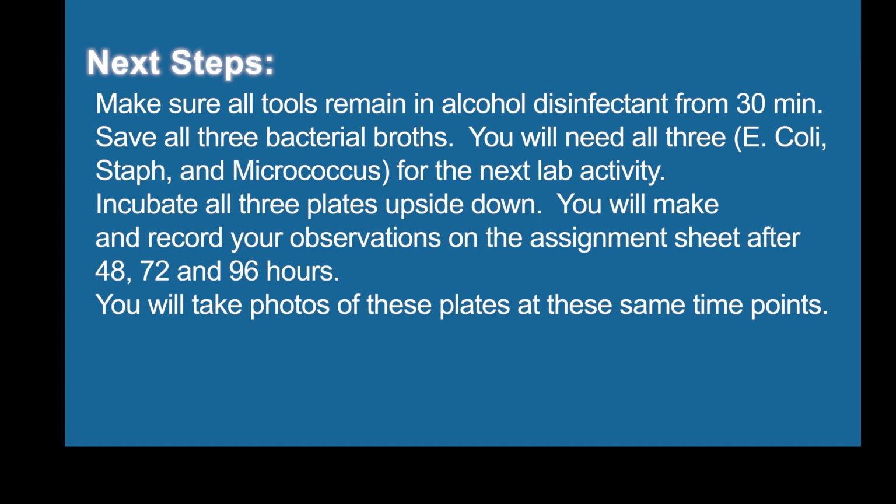So the next steps include making sure that all of these tools remain in the disinfectant for the full 30 minutes, as we've done in each and every lab. In terms of cultures you need to save, all three of these bacteria that you just used, the broths that you have, so E. coli, staphylococcus, and micrococcus, we need in the next lab activity. So do not discard any of these three broths. You'll need them for the next activity.